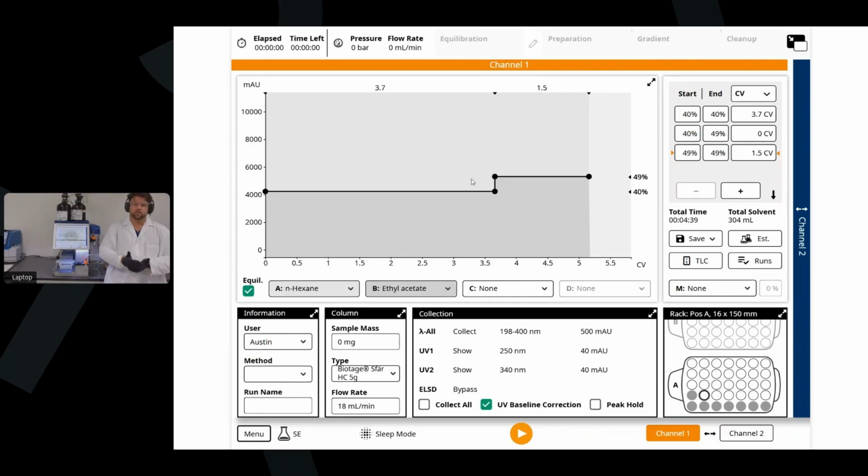So what that's going to do is ideally improve resolution, because the solvent that you're using is eliminated, but those polar solvents are going to drag your compound onto the column quicker than if you're using a weaker starting solvent, especially if your conditions have a low strength to begin with. So you're going to see a lot of resolution loss from that.